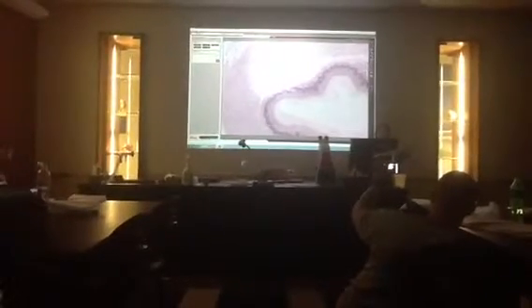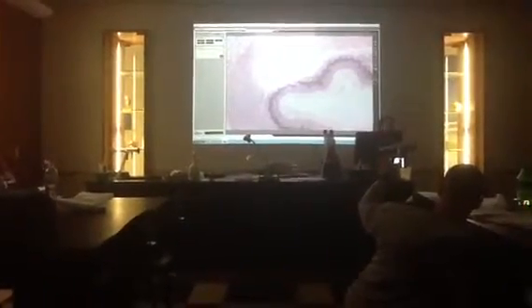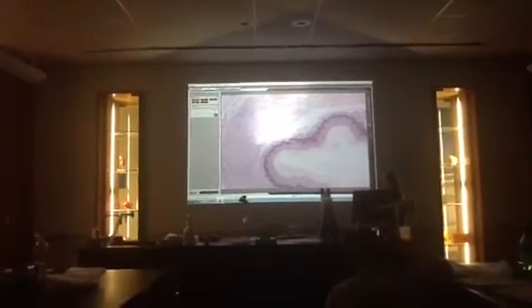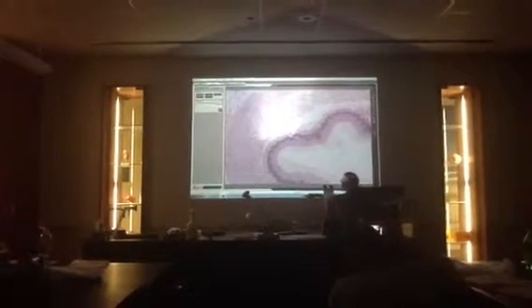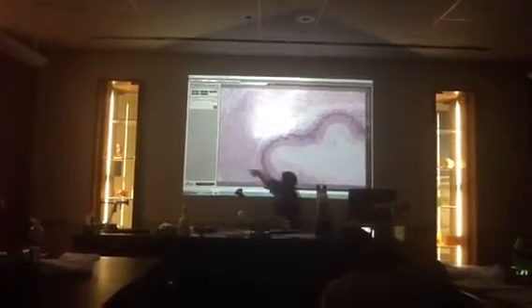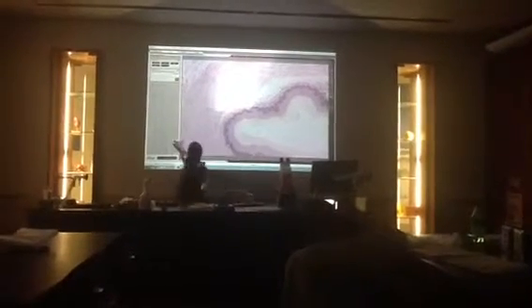The next layer that we have is the muscularis externa layer. It has two different muscle layers in there. You have the circular and the longitudinal. The circular looks like it's making big circles around the lumen. It just keeps going around and around. It's the inside layer. The longitudinal layer is to the outside of that, so it's over here.